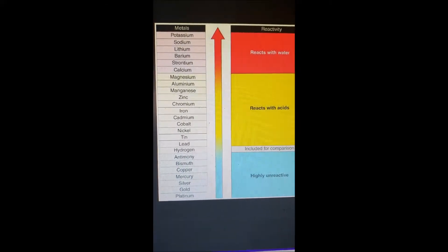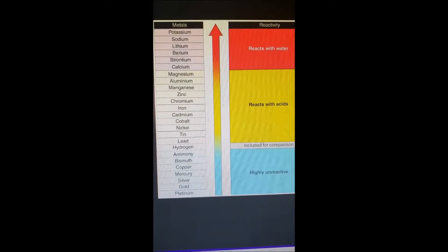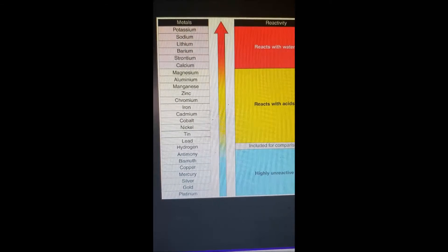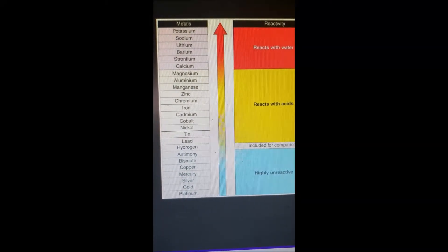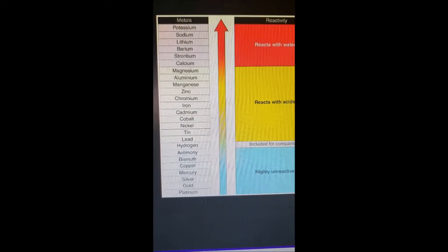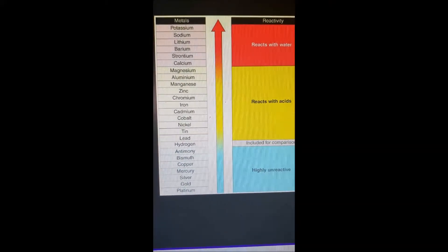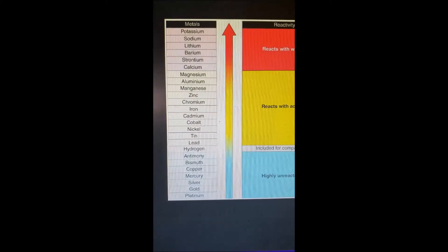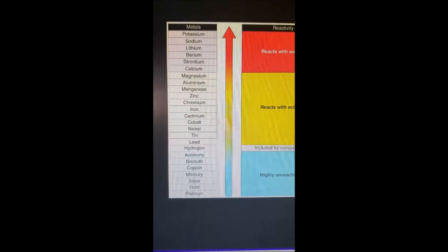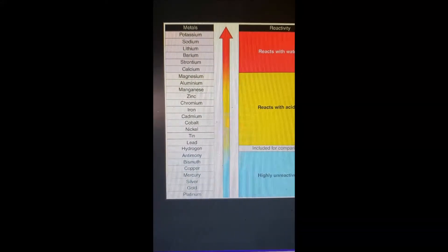Then I'll put nitric in there. Nitric will hopefully get rid of the other things that the hydrochloric couldn't. Same thing — I'll hold it for a couple of days and put it on heat. Drain off the nitric, rinse it, wash it properly. Then start with some more nitric to give you a second dose, and try to make sure I've got everything I can possibly get out of solution. And what I should be left with is gold.